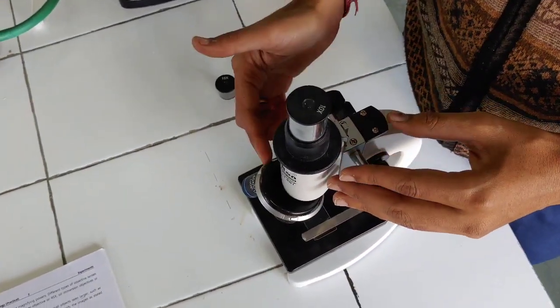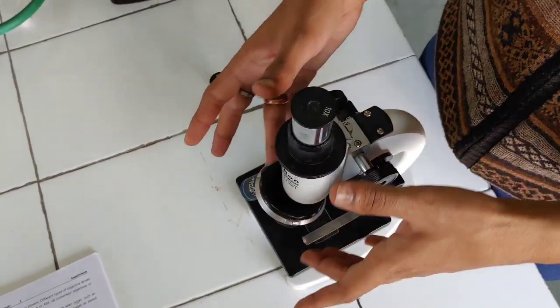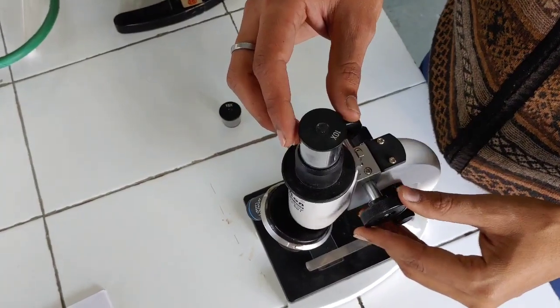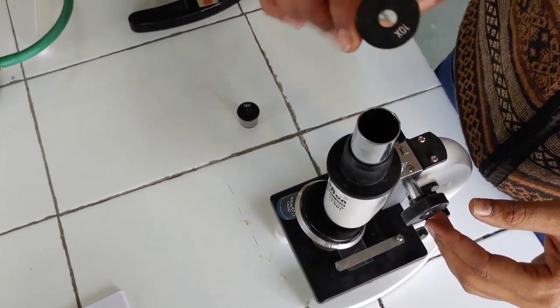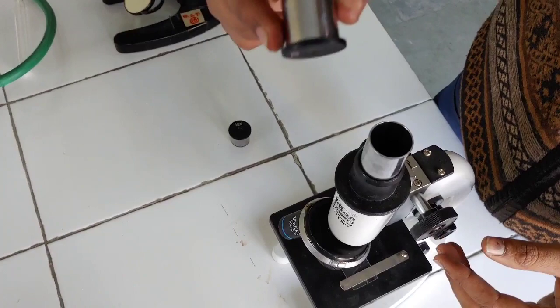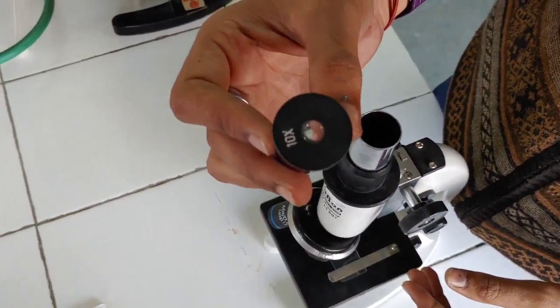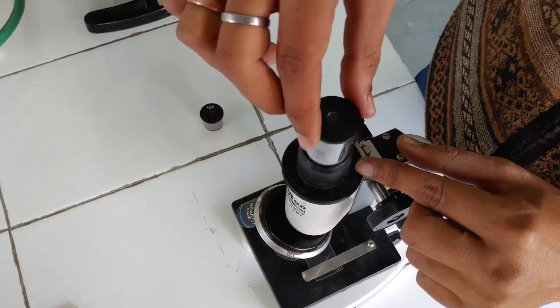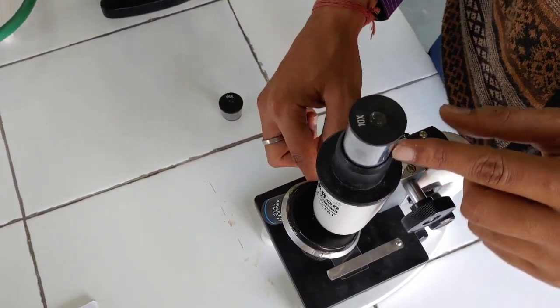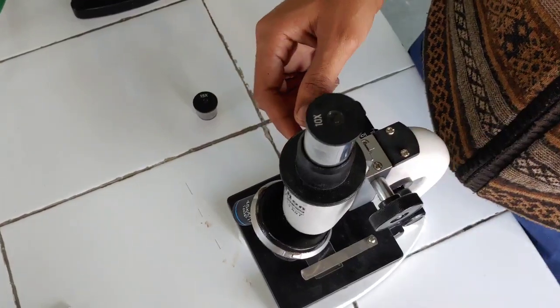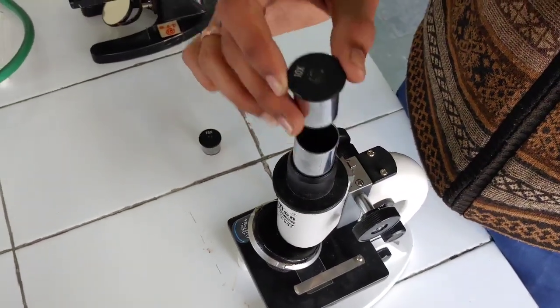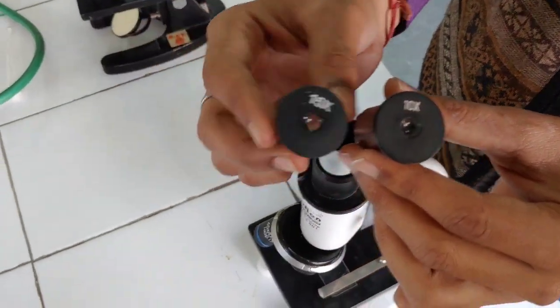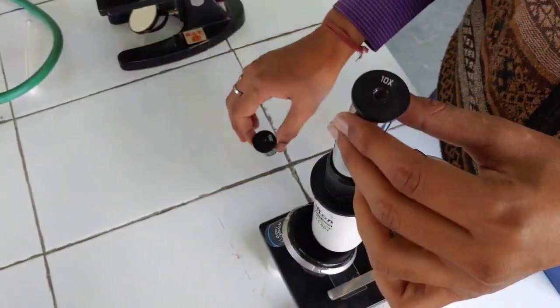Now, the third component is the magnification system. Within the magnification system, the first is the eyepiece. What is eyepiece? It is a lens that fits into the top of the body and it magnifies image formed by the objective. Generally 10x or 5x or 15x, whatever you can use for your purpose.